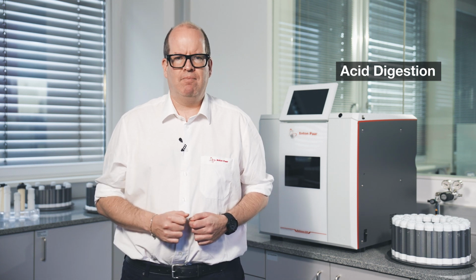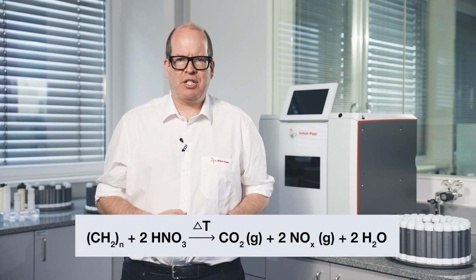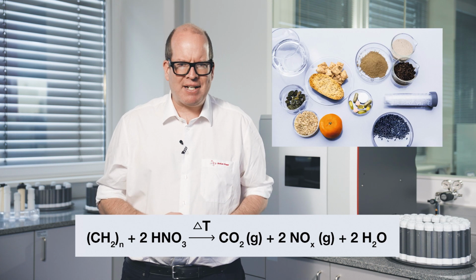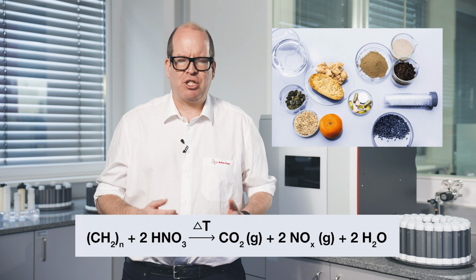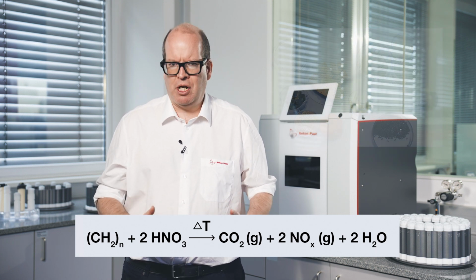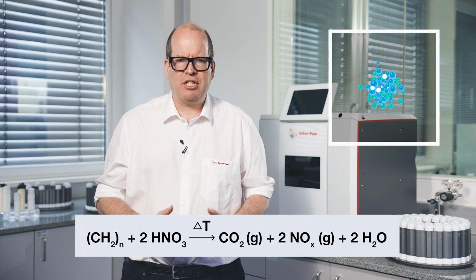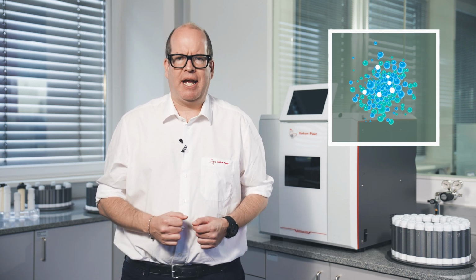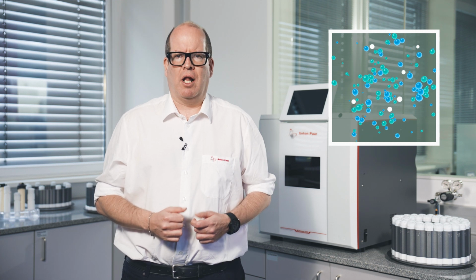Let's look at the chemistry. What actually happens when we add acid to an organic sample? The acid, usually nitric acid, oxidizes and decomposes, that is to say digests, organic matter such as food, pharmaceuticals, polymers and petro samples. As a result, carbon dioxide and nitrous gases are formed. Trace elements that the sample might contain remain in solution, while the main components are destroyed.